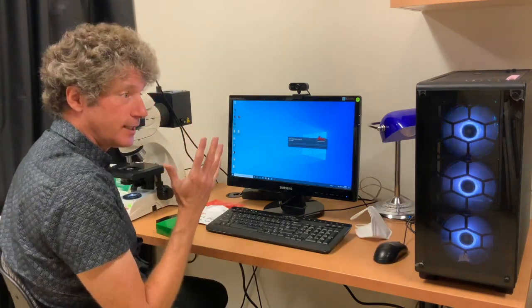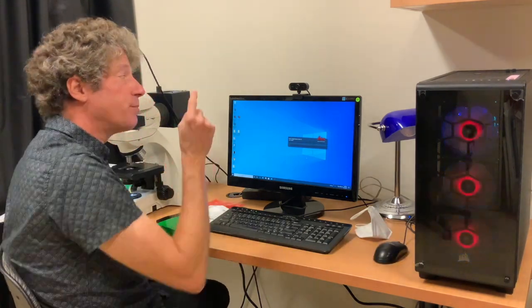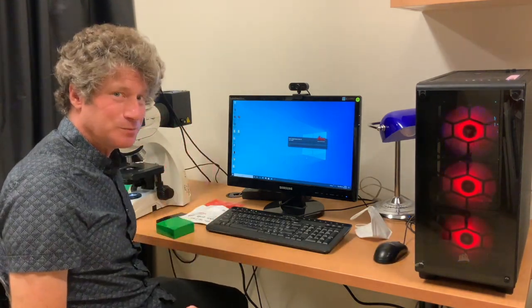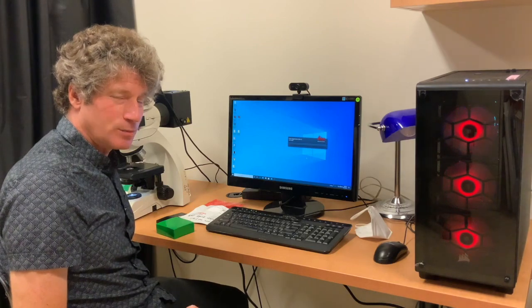It loads up, and now I'm going to jump onto the software and show you what to do. Welcome to class.